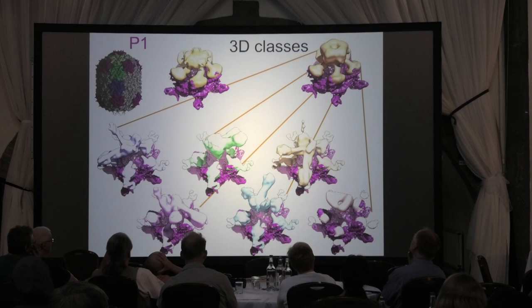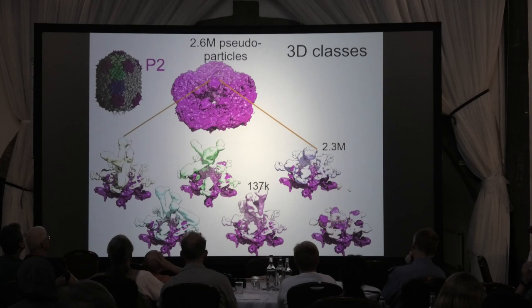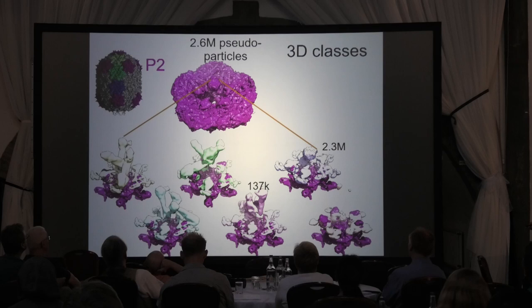generic blob. And again, if you slice this one up, we see some somewhat interesting blobs, but nothing as specific looking as this. And then moving on to the second penton, we see more or less the same thing. Maybe if we sliced up these other catch-all classes, we would see different ones. But for the time being, I haven't done that, and it's not relevant to this talk.